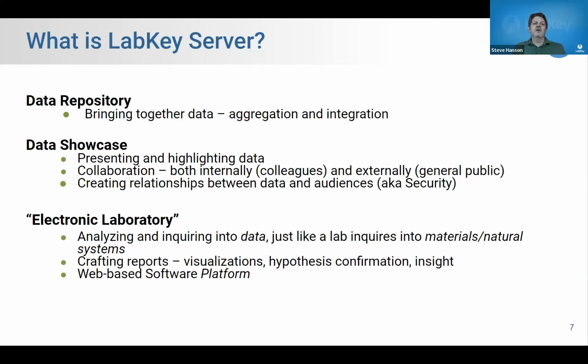This also includes all the features that are about latching that data together. A lot of times scientists have lots of different kinds of data. They might have clinical data, questionnaire data, assay data from the lab, sample data from the freezer, things like that. But they don't necessarily know how to hook them together. Well, this first group of features also knows how to latch those data together to form a coherent and analyzable whole.